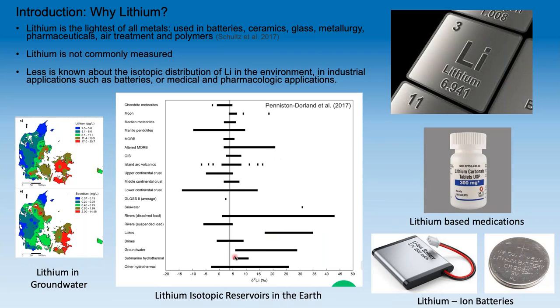And if you mix anything together, you can get a lithium isotope signature. Now, what's important here is note the scale. Okay, we're looking at 0, 5, 10, 15. So if we can measure a 1 per mil variation, we're doing pretty good. We can really start to tell some of these things apart, except where the reservoirs are completely overlapping. But we're really looking for a 1 per mil precision.